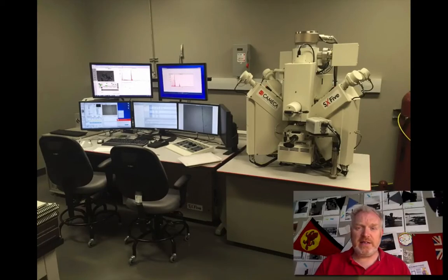Hi, in this lesson I want to look at the analysis of very, very tiny minerals that we can find in rocks. We're working on page 12 of the Theme 3 booklet, and these techniques, sadly we can't do them in school, but they're really important, particularly looking for the rare and important minerals that we call the rare earth elements. They're essential for modern technology, yet they occur in tiny proportions within rocks.